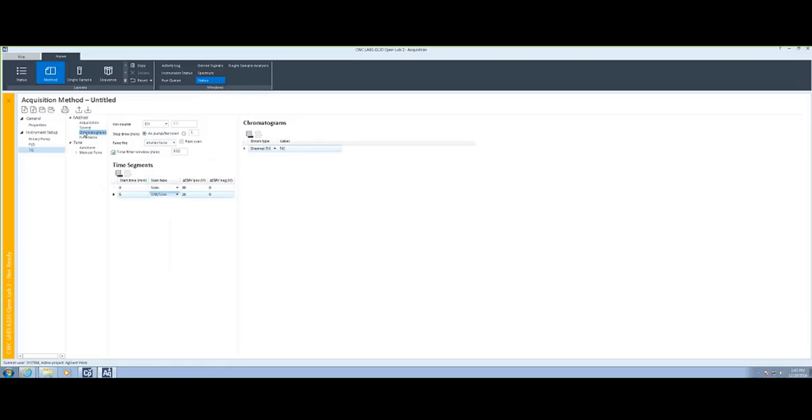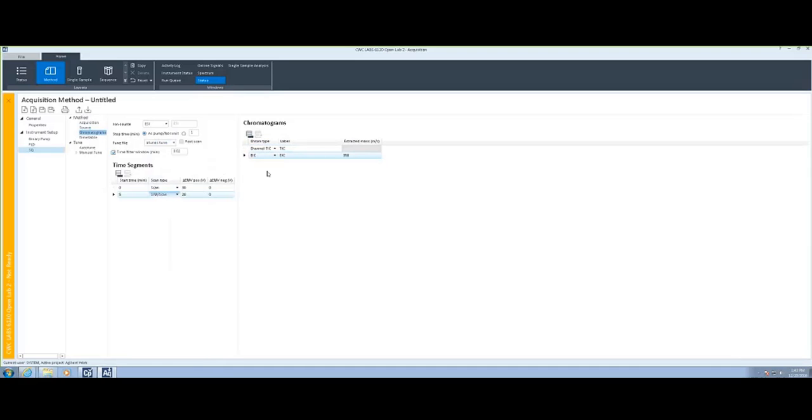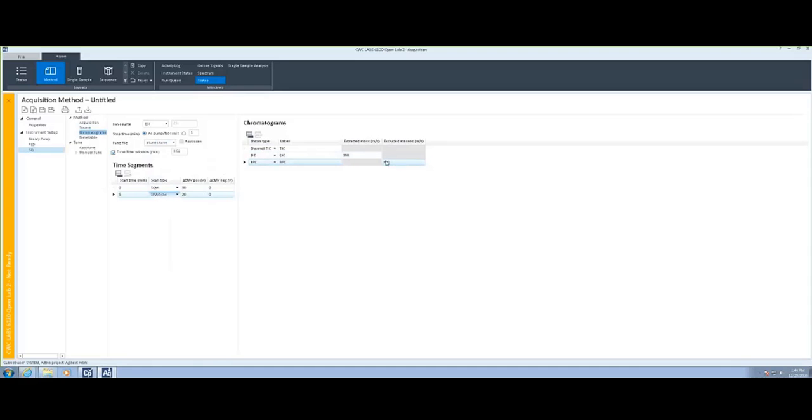Going to the next item down, these are the chromatograms. This is where we can define exactly which signals we are going to capture from the mass spec. You can have an EIC on one channel, a SIM on another channel, a TIC, etc. There is also a base peak chromatogram available.